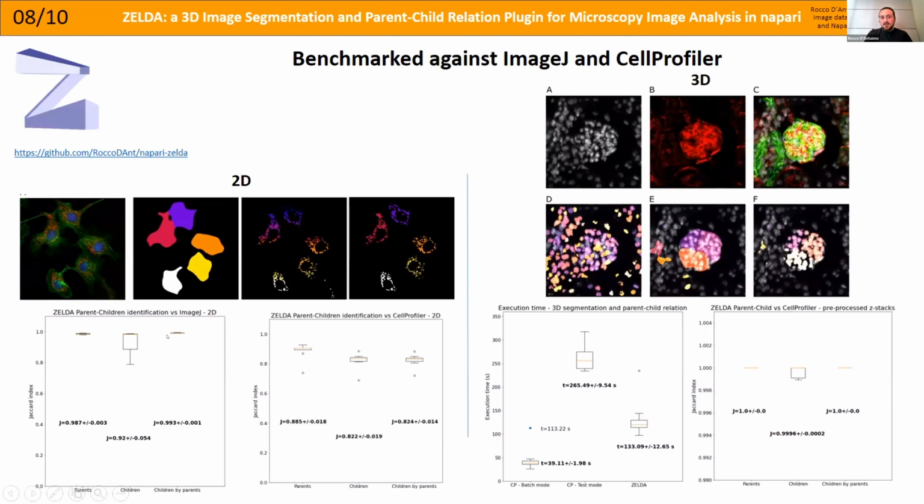I've done this in 2D, and I also have done this in 3D. And beyond doing this, I've also calculated how much time it takes for a user, looking at the experience that a user can have with the graphical interface, to go from the left to the right. So from the beginning, where there is the grayscale image, to the end, where there are instead data. So I've tried to write, for example, in CellProfiler, a similar pipeline that does all the steps, or run manually in Fiji the different steps that bring from the grayscale image to having the results.